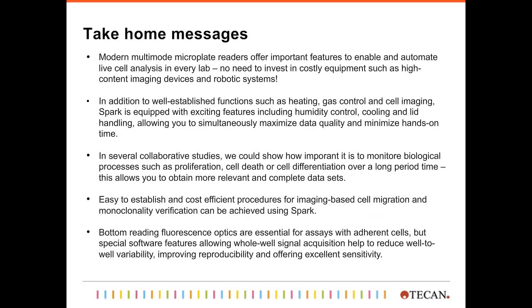Good. So finalizing my first part, I want to give you some take-home messages. So first of all, modern multimode readers offer more than just absorbance, fluorescence, and luminescence. They enable automated live cell analysis, and this is really a cheaper, let's say, and more cost-efficient approach than investing in high-end robotic systems or high-end live cell imaging systems. And of course, it's better than staying in the lab for the whole night.